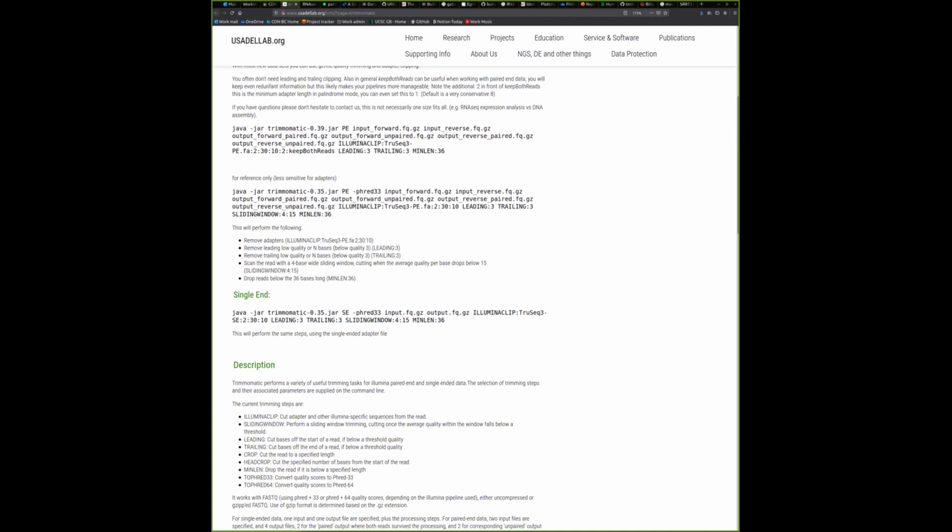Right. Today I'm going to use a script that I prepared beforehand. I'm going to paste the link to the files here. So go ahead. I hope that you are still in the scripts directory. If you are away from the scripts directory, please go back to scripts and download these 2 files into your scripts directory. So it's already on Etherpad. You can copy the entire thing, do the 2 curl commands, copy this into your terminal and download it. So I'm going to do that as well.